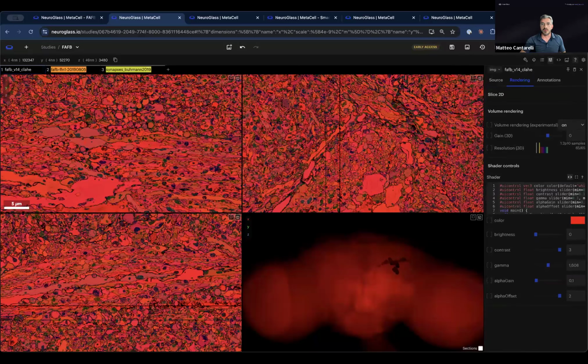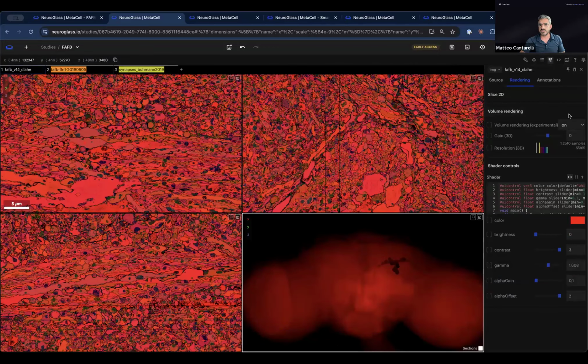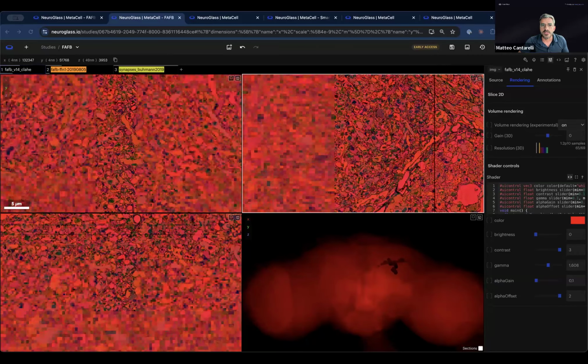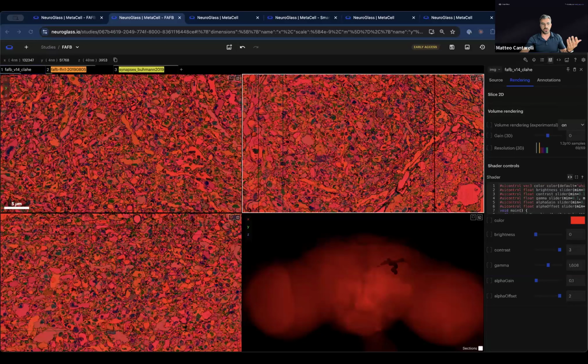How do you work with people? Let me just do the following. I will copy this study link, which I have set as public. So let me see if I can find it. Probably the answer is no. Oh, here it is, chat. So I just pasted in the chat a link, and anybody can click on it, and you will be inside of this particular study. Of course, you can have all sorts of permissions: private, public, people can read, and so on.